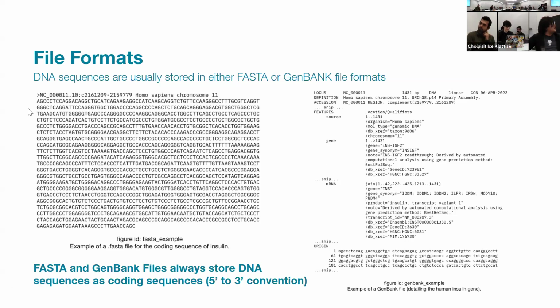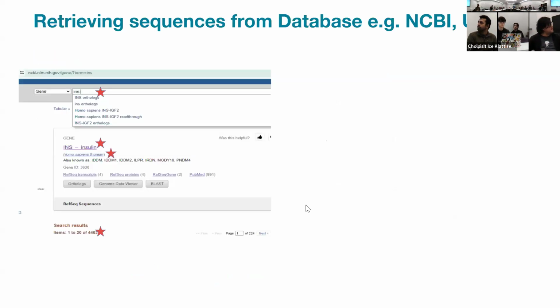Another thing that's very important is that you see they don't have a lot of information about the 2 strands of DNA. So the program will also help you copy the other strand. And it's not a simple copy, right? It's the reverse complement. So if the A is on the top, T should be on the bottom. So this program helps us a lot in exploring what it is.